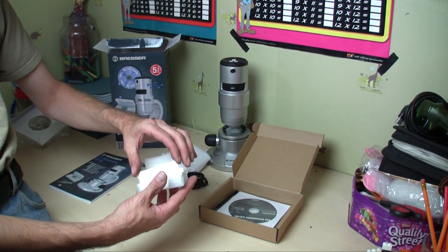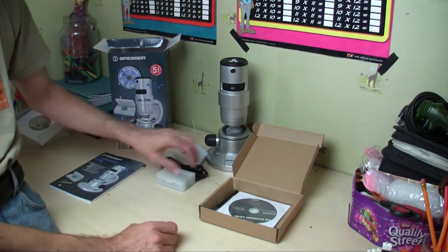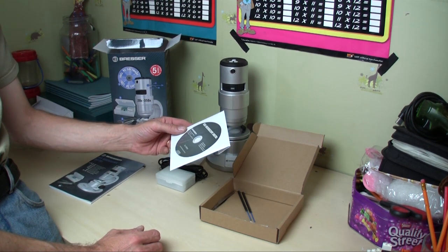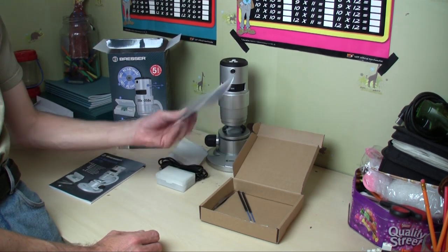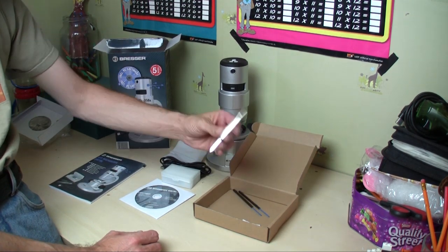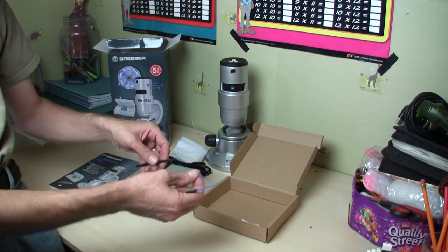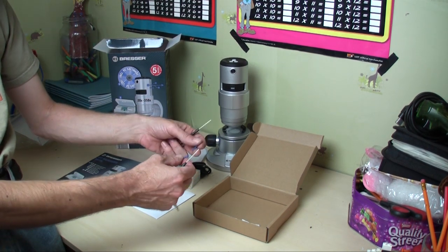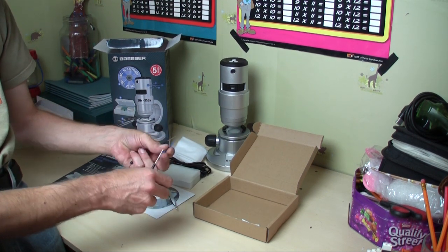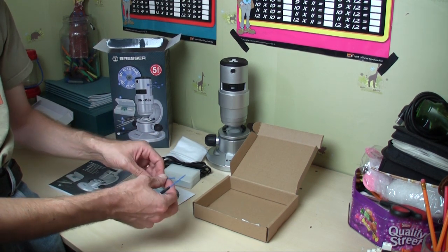There's also a little packet of silica gel in there. You have a disc with some programs and drivers, a pair of tweezers, and a pair of pointers for helping you get things ready — for getting things on your slide and dissecting and things like that. I suppose you could use them for acupuncture as well.